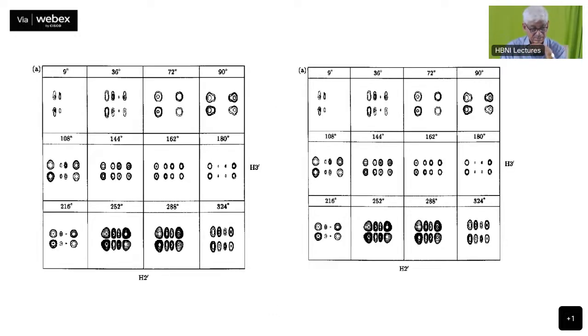Okay, so this is another one of the same. This is the 2', 3' coupling constant, 2', 3' cross peak. Once again, you see a lot of variation in the peak pattern as you vary the sugar geometry. All from here to here, there is so much variation in the cross peak fine structure, the 2', 3' peak.